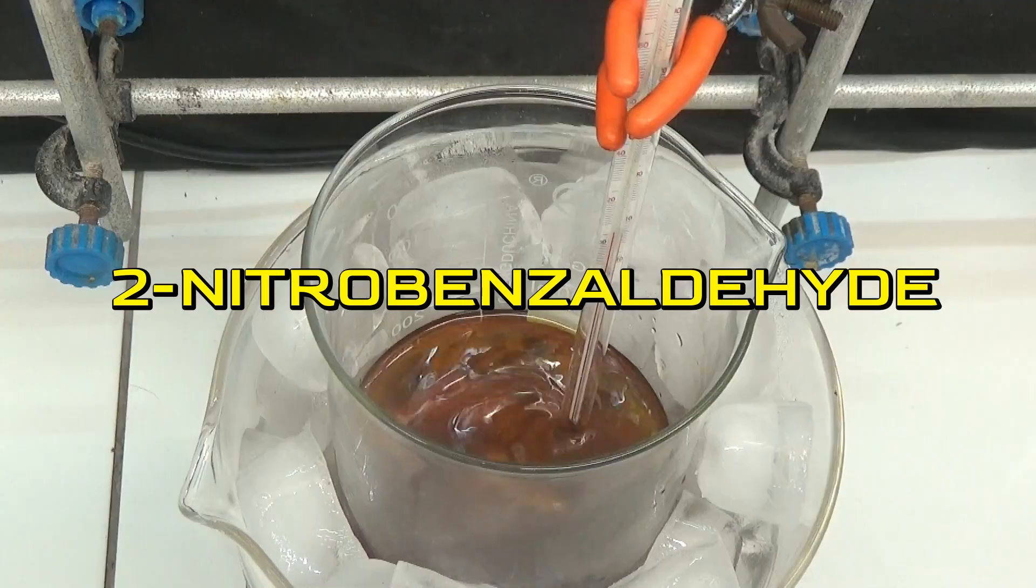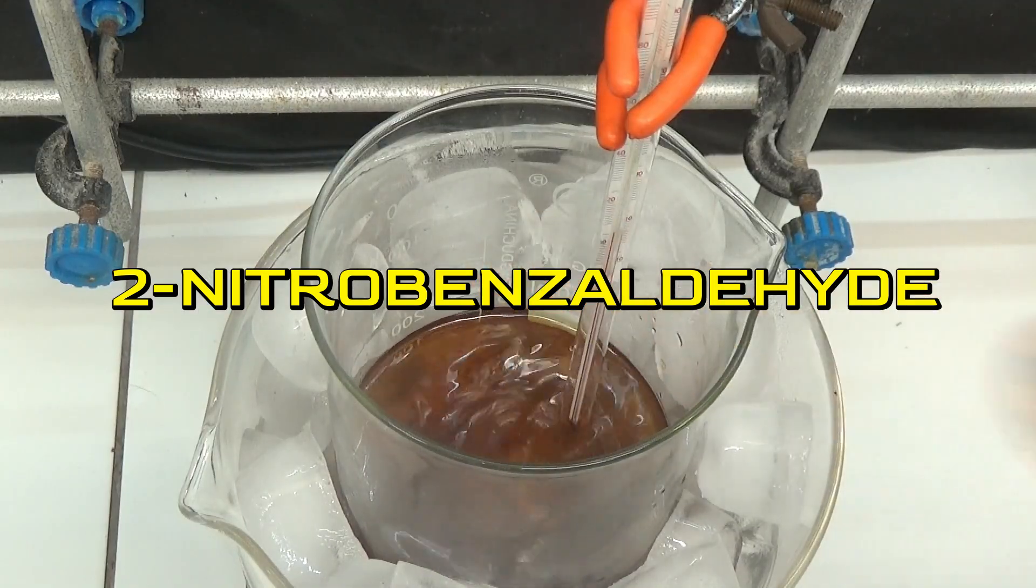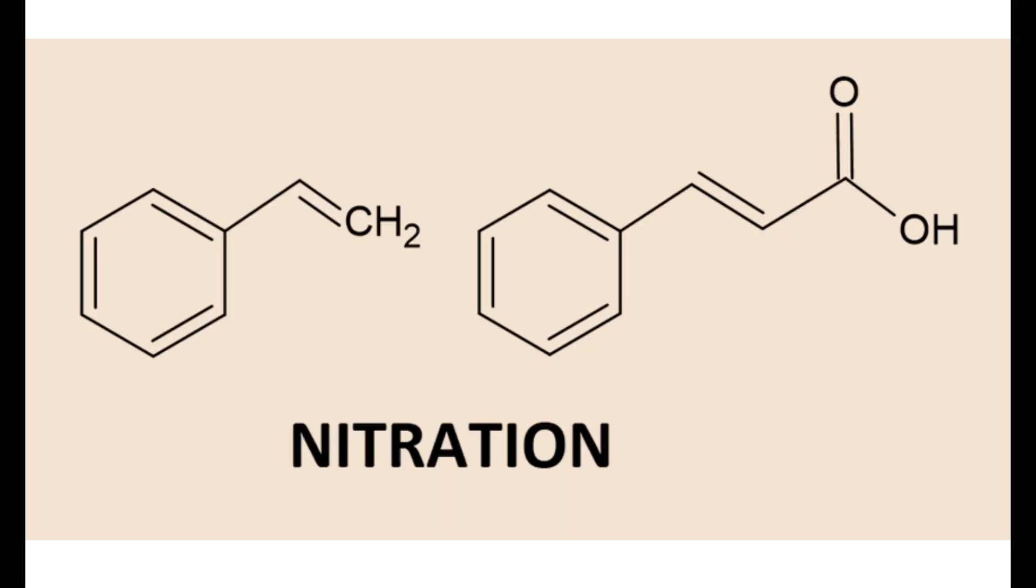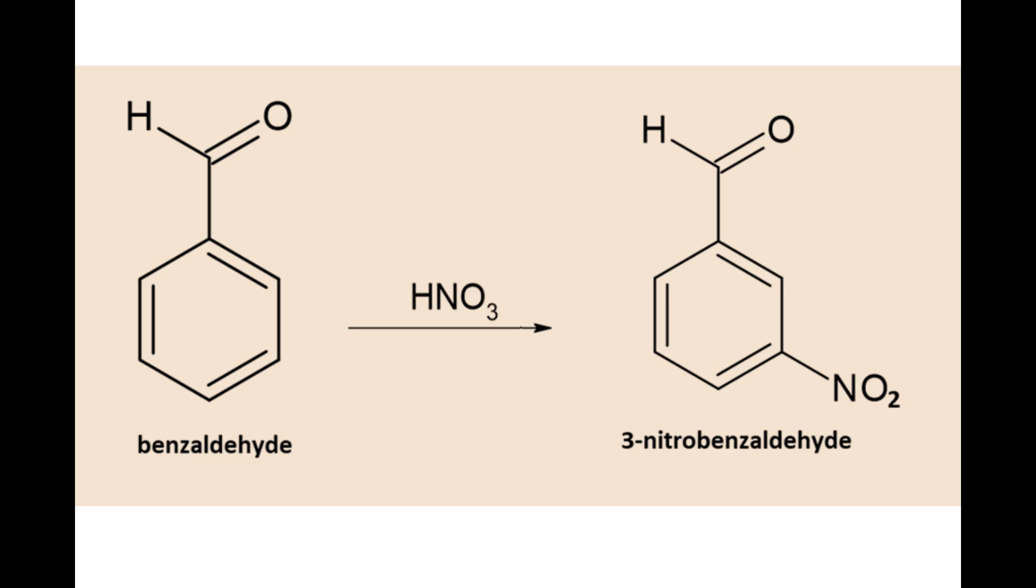In this video we are going to obtain 2-nitrobenzaldehyde. For this synthesis there are several routes to obtain it. The main routes are by nitration of styrene or cinnamic acid. If direct nitration of benzaldehyde is attempted, this route does not yield good yields and produces mainly 3-nitrobenzaldehyde.